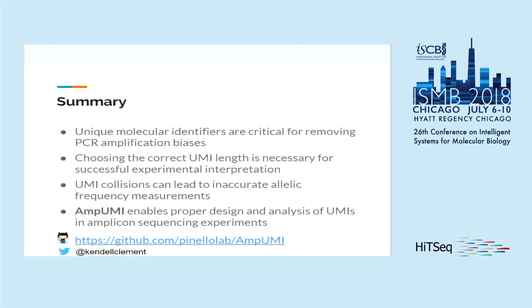And then finally, how AmpUMI, which is the software we've developed, can enable proper design and analysis of UMIs in amplicon sequencing experiments. Here I just have a link to our GitHub page, as well as my Twitter handle if you'd like to contact me.